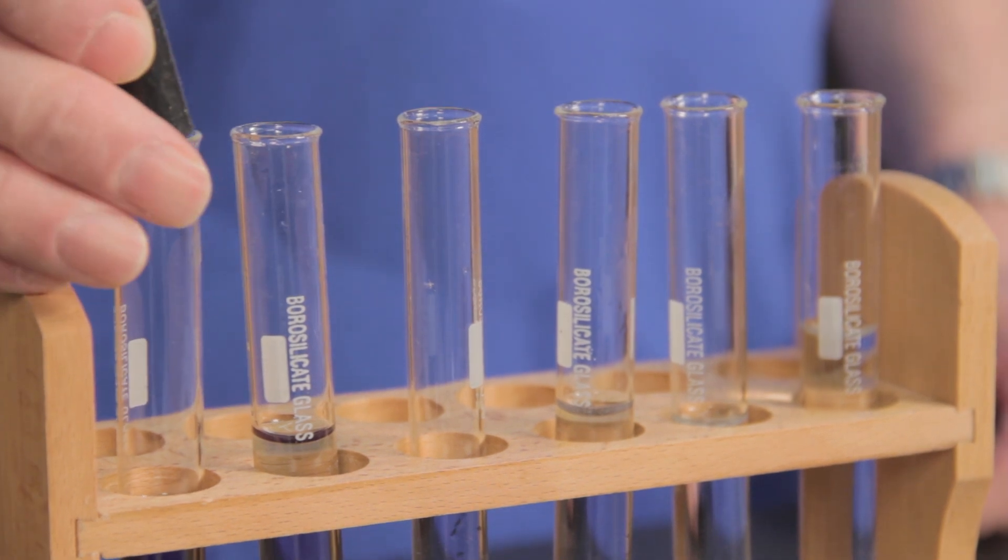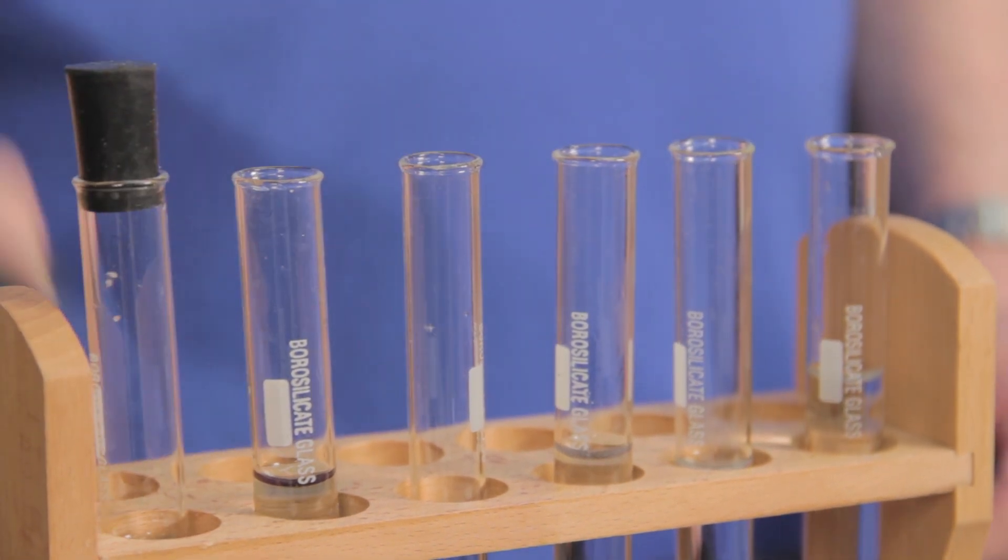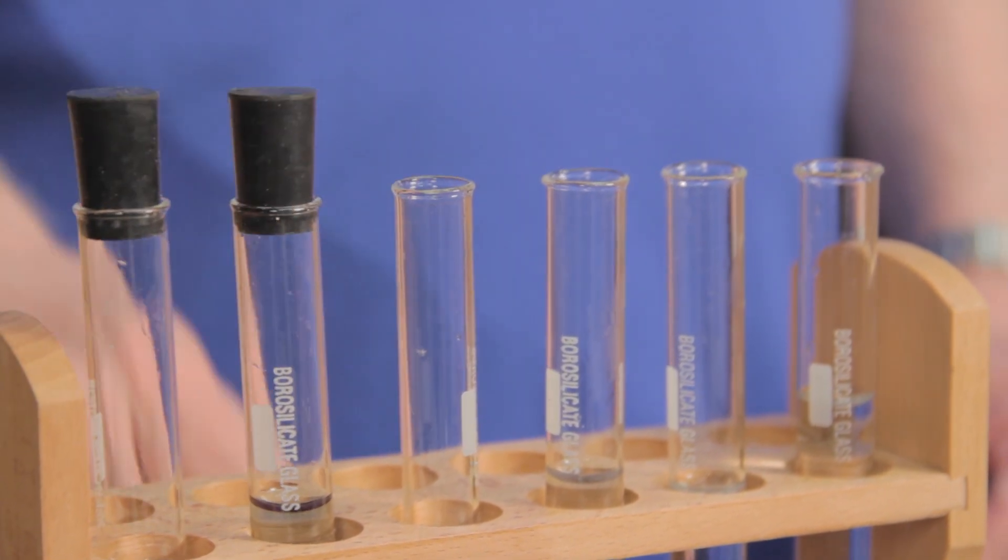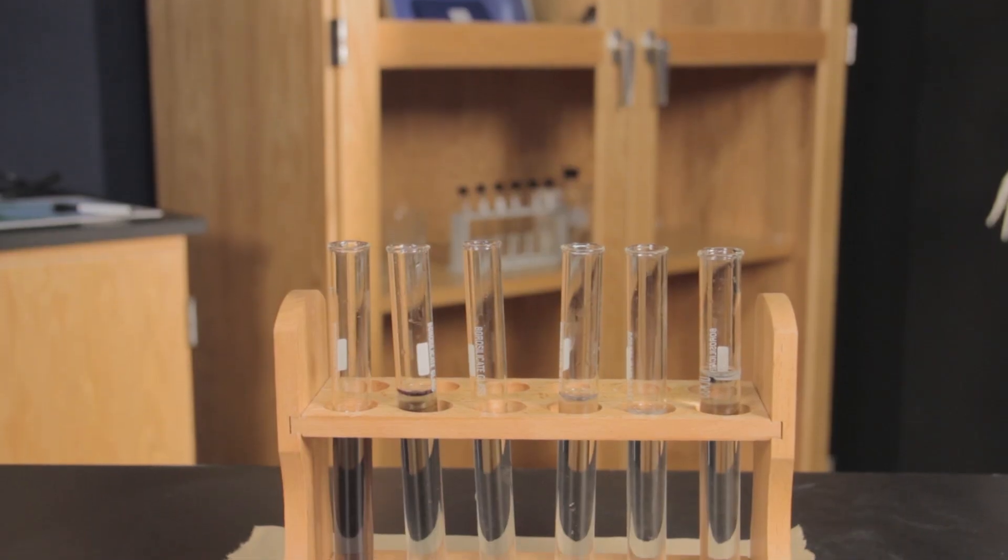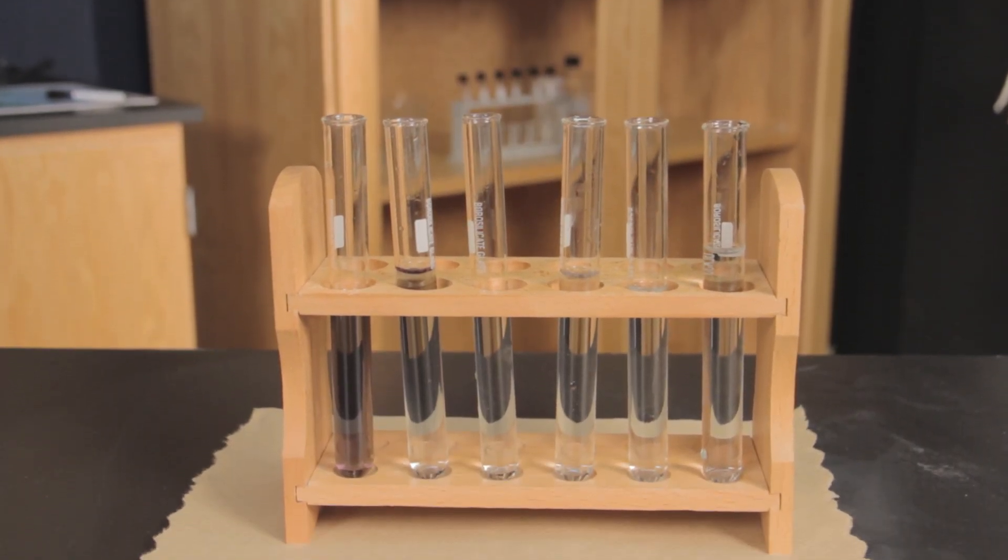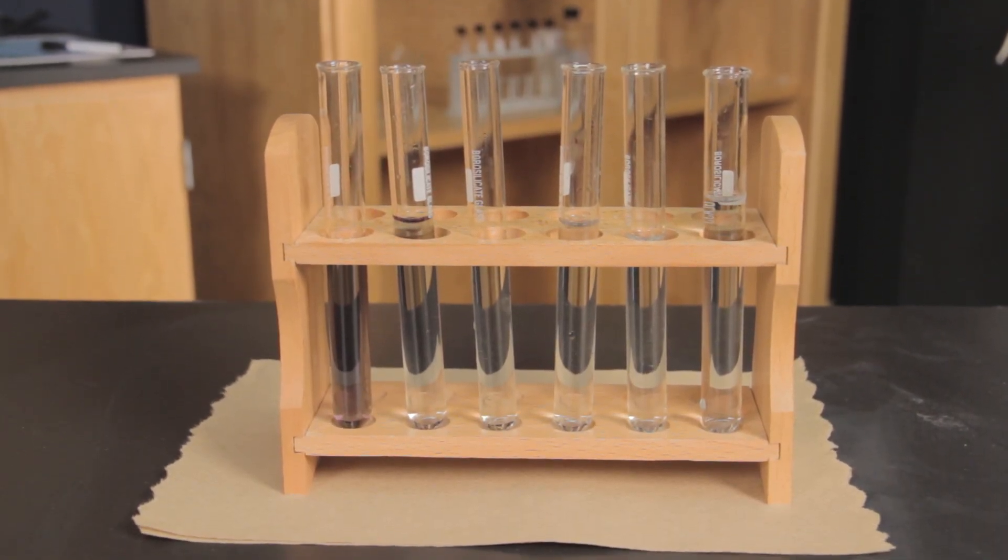Like with Erlenmeyer flasks, appropriately sized stoppers can close test tubes temporarily. Finally, the size of test tubes allows for easy and efficient storage in your lab.